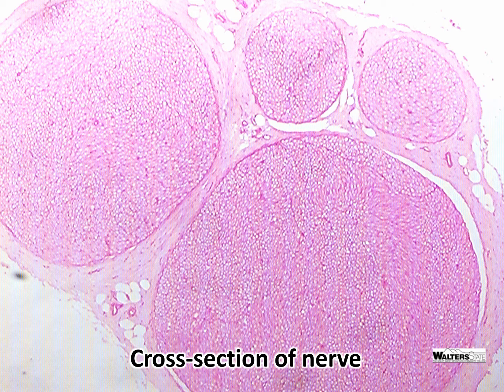So we're going to go through 1 week's worth of lab materials in this PowerPoint, and the very first thing that we're going to cover is the cross-section of the nerve. So this is a cross-section of a nerve at a fairly low magnification. There are some structures you can see and others that you can't.